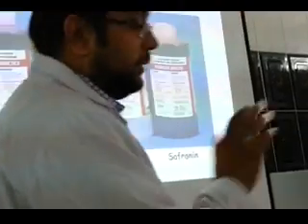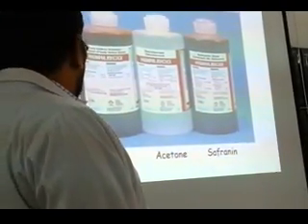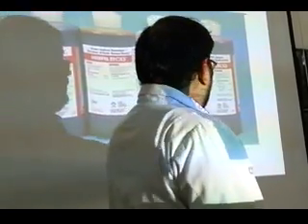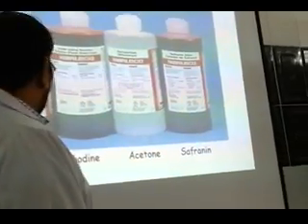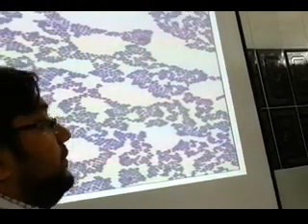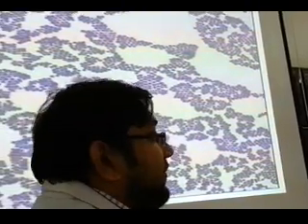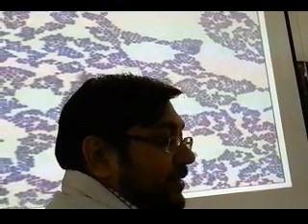Okay? So crystal violet, iodine, acetone, safranin. This is the CIA for Saudi Arabia. Okay? Crystal violet, iodine, acetone, safranin. So you remember. Okay? So this is what? Gram-positive. Positive or negative? Positive. Safranin? Okay.